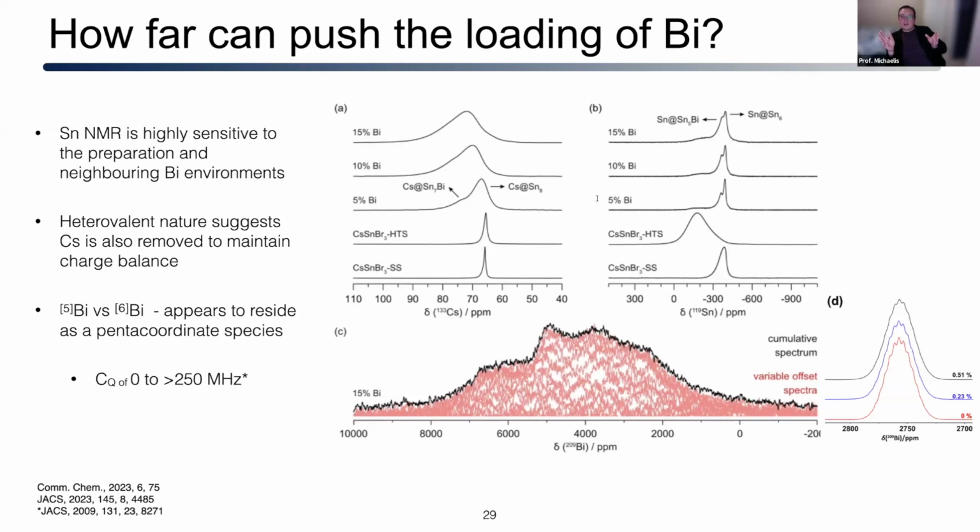In terms of pulse sequences, the typical ones we rely upon are echo, either a CPMG or WURST-CPMG approach. If you have protons around, or you can use something that's a high gamma nucleus, we do cross polarization or HETCOR-based experiments. But for the bulk of them, they're pretty much one-dimensional type: typical Hahn echo, solid echo, CPMG or WURST-CPMG to do most of these.